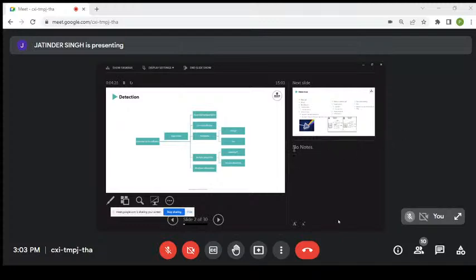So again, what you want to do, where you want to use it, will depend on how important it is to integrate or not to integrate your detector. And that goes hand in hand with portability. On-chip, off-chip is also a little bit with the detector, like electrode integration, as we'll find out, is quite easy to do. Integration of a mass spec, probably need 15 years and a good team of engineers for that.